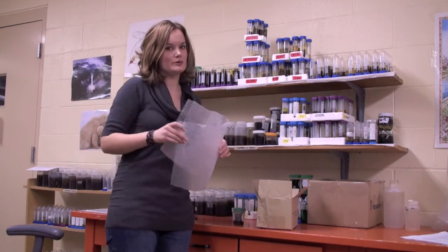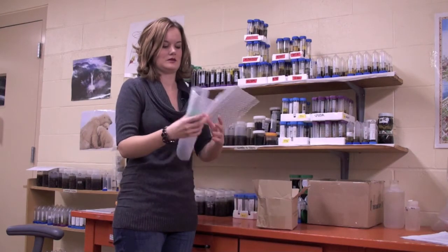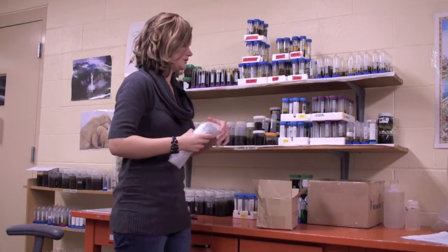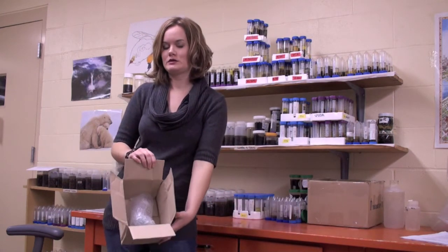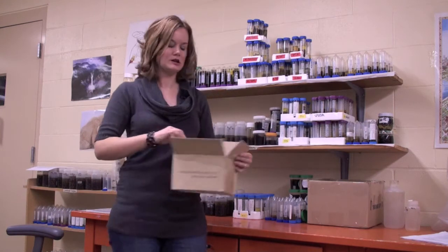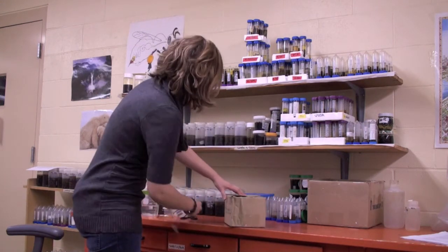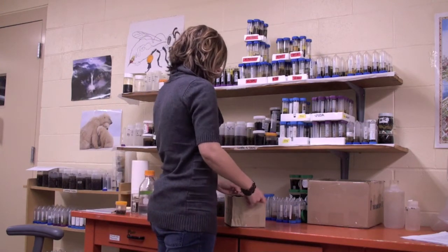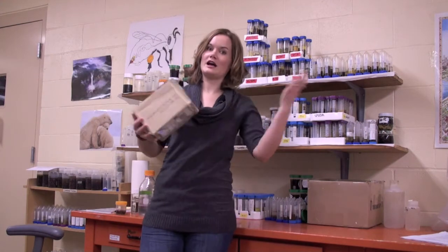And so that the sample isn't rocking around in the mail, we just kind of wrap it around in bubble wrap. Stick it in the box like so. Obviously you can use packing peanuts or whatever you have available, newspaper, and then just shut the box, grab some packing tape, put an address on it, and boom, I have your sample.